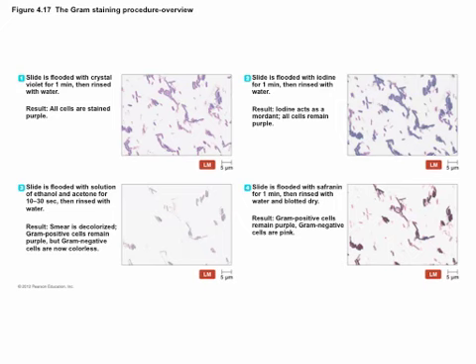Second step is you add iodine, which is sometimes called Gram's reagent. Does anyone here know what that step is or what that reagent is for, what its job is? There's a special word for it. It's a mordant. A mordant, it's a word that you mostly see in like painting. But basically, if you think mordant, think mortar. What do you use mortar for? Putting up a wall. But basically, it's a cement. It's going to stick two things together. A mordant is going to be something that allows something to bind to something else.